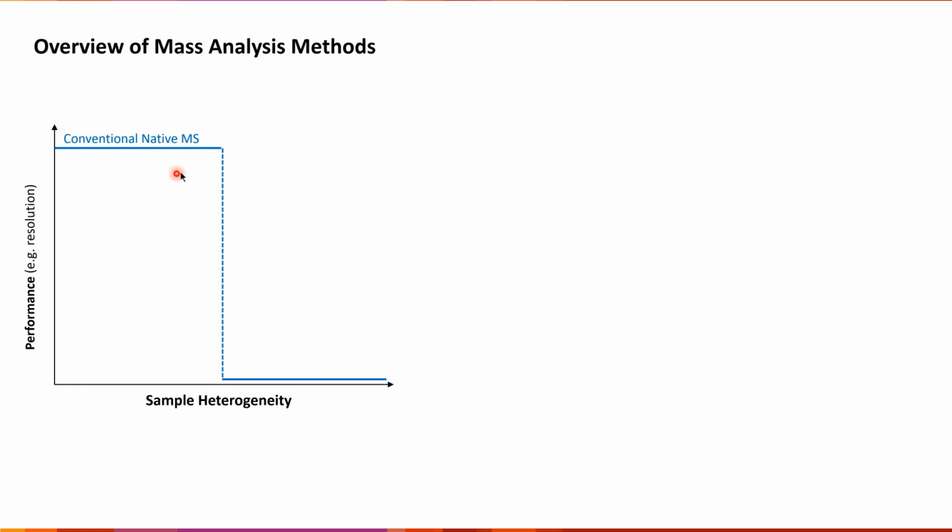It works really, really well up until the point where the charge assignment becomes too challenging, and then the performance drops quite substantially. By comparison, these single particle methods, although as of right now, the resolution is quite a bit lower than conventional native, have a strong strength in that they're less sensitive to the sample heterogeneity. So once your samples become heterogeneous enough, they sort of take over. And in this regime, these single particle methods work extremely well.